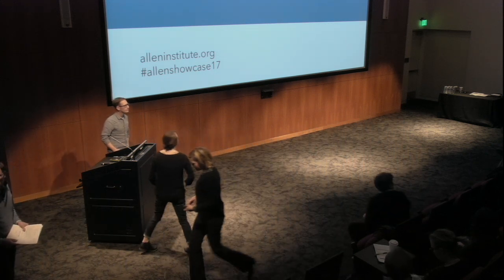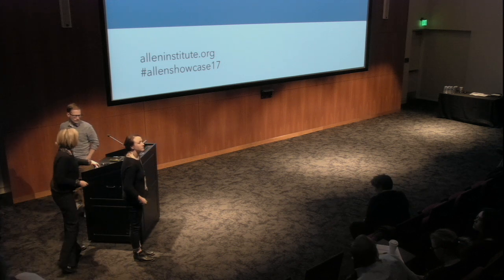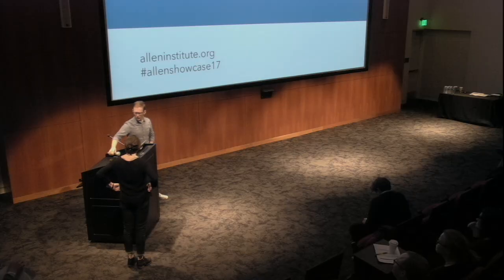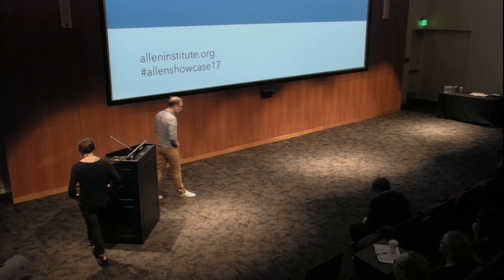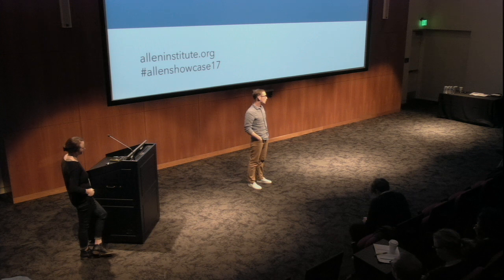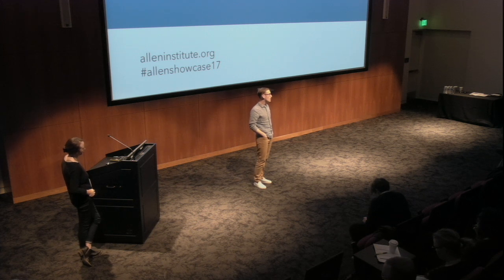I just wanted to ask you whether you think the rules are going to be general across cell types. That's a great question. So, no, this has to be retrained, not only from cell type to cell type, but from imaging modality to imaging modality. If you substantially change your microscope settings, that'll change how those images come out, and you'll have to retrain your models.